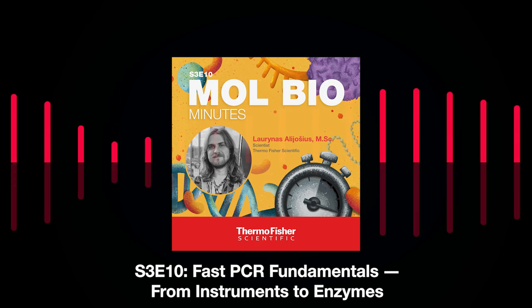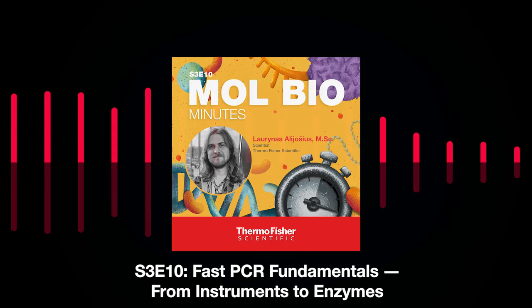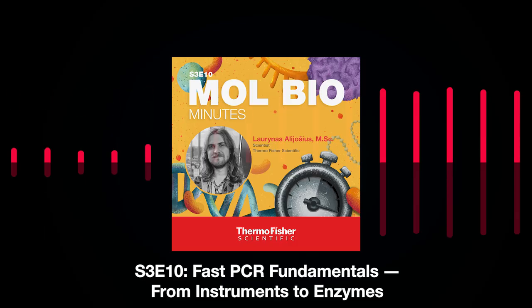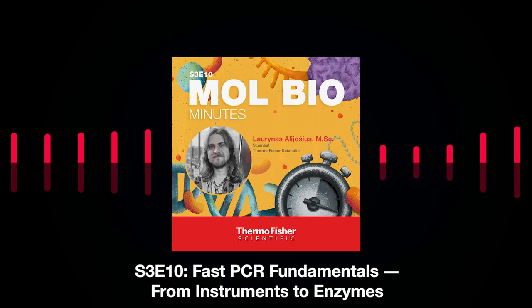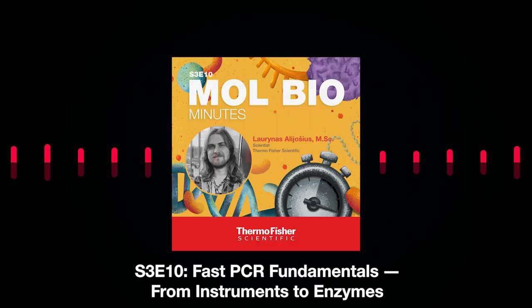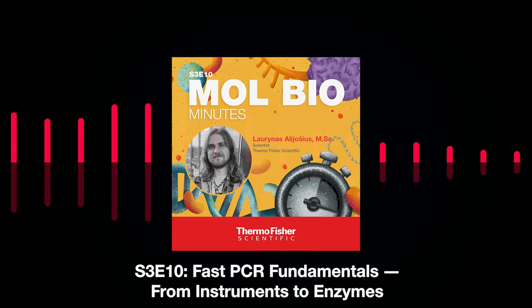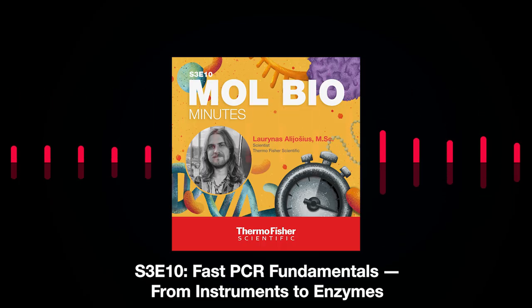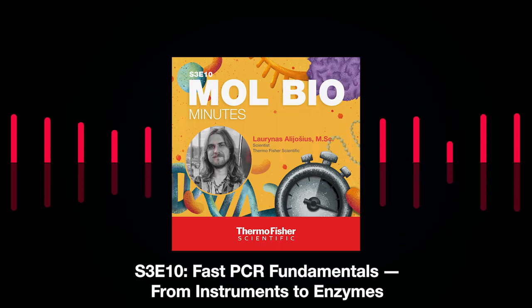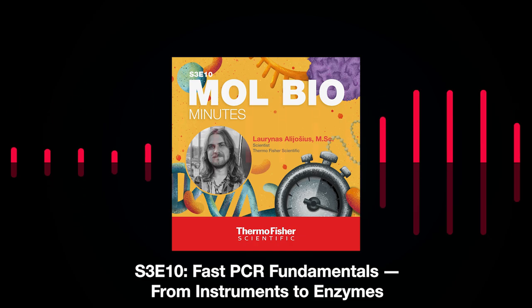Next, let's talk about choosing good PCR plastic for your fast PCR. You may want to think about using plastics with thinner walls because they allow for faster heat transfer through the plastic for the reaction to occur. And you may also want to think about using plastics with sample wells that have lower volume because that also helps for a quicker reaction to occur more efficiently.